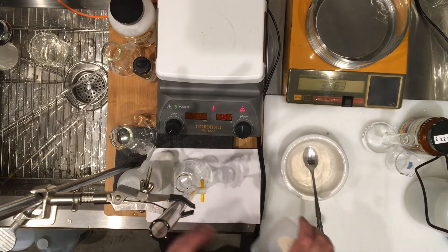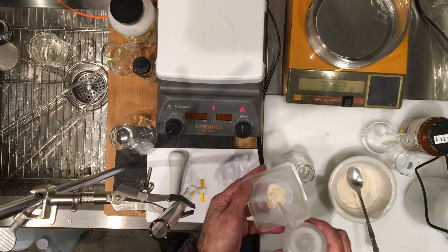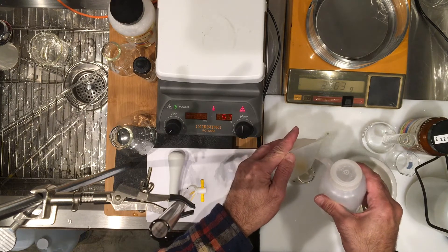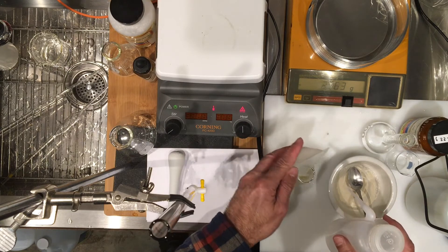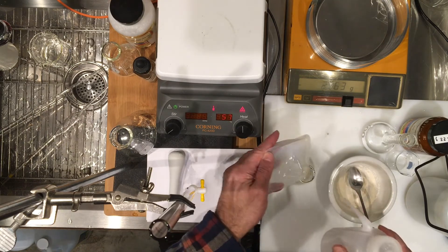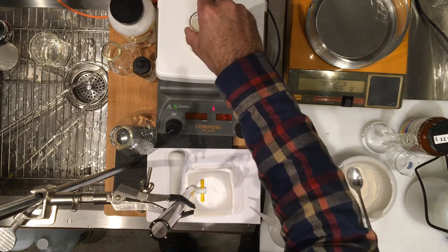I'm going to transfer this. Remember the solid method of transferring — it tends not to scatter the powder. I'm going to transfer the contents to the flask. The vitamin C content should get dissolved, so I'm putting it on a hot plate.